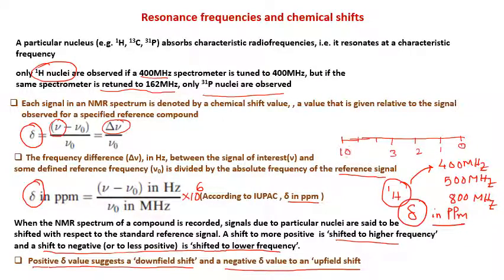You can see 10. So this is the chemical shift region. NMR is interpreted along this direction. At 0 ppm, normally the reference standard, TMS, is observed. Delta is equal to 0. The reference standard molecule is observed at delta equal to 0. Now there is also a negative part, -1, -2.